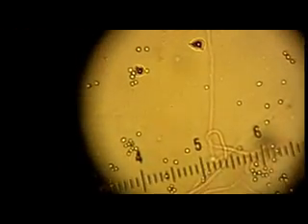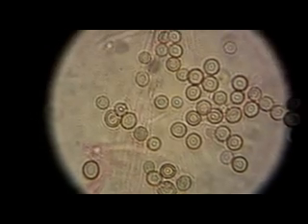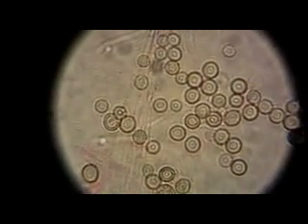These are the fungal spores under 100x power. Now we're going to move it up to 400x. And the fungal spores are much larger.